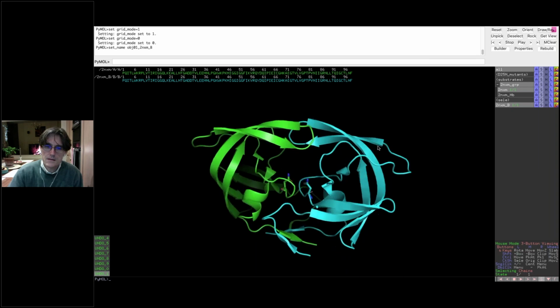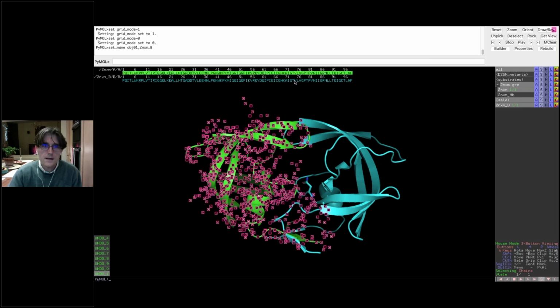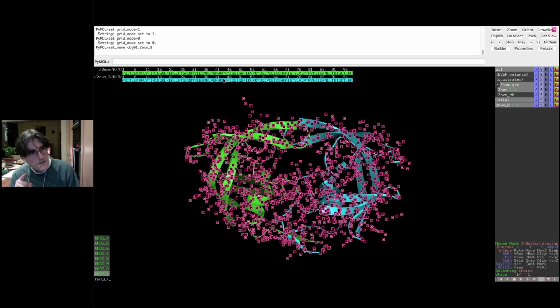If I wanted to do the inverse and create a brand new object from these, I would select the two things. Before I did this, I would make sure that the chain IDs are different. If they're the same, PyMOL gets incredibly confused. It would end up having 2 different sets of coordinates for residue 1 in chain A, and it creates all kinds of problems. So one thing you might need to do is alter the chain of the object.